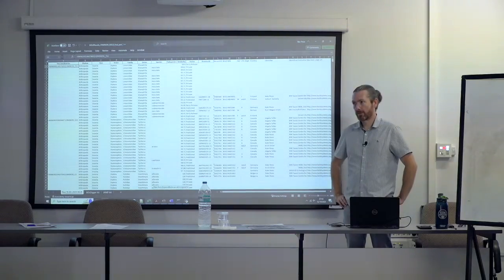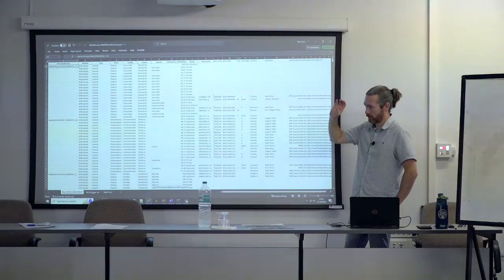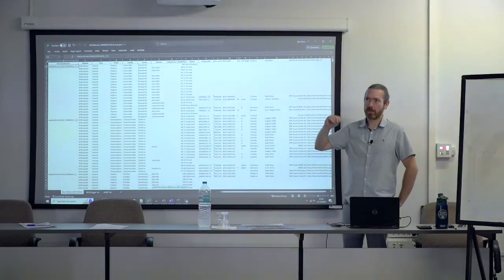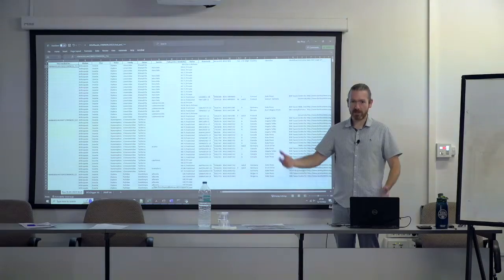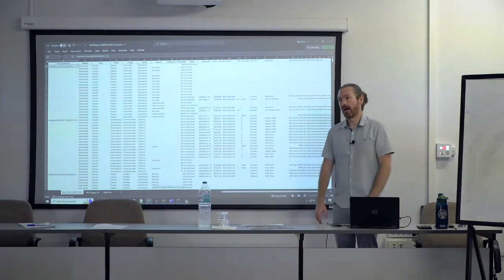Yeah. So that's what we're doing in the reference library curation side of things. The goal is to take all of the data in BOLD, run it through a pipeline where we have criteria that I'll go into more detail on, criteria that give the records various grades, and then certain grades will be handed over to humans to check. And they're things like where this BIN has more than one species name. Someone go look at it. Oh, 20 of them are one species name, and there's one from a master's student with a different species name. Deprecate that record. Now it's nice and clean, you know.